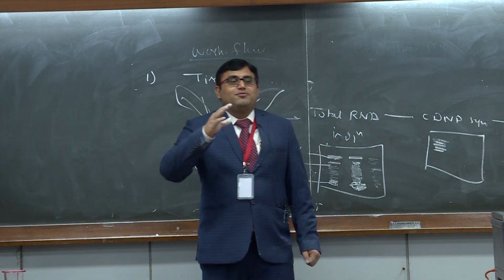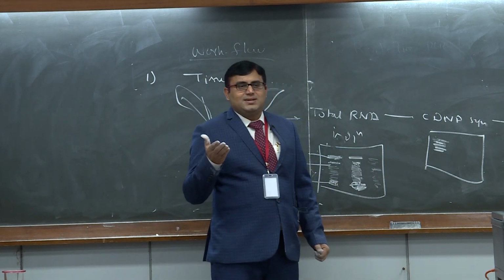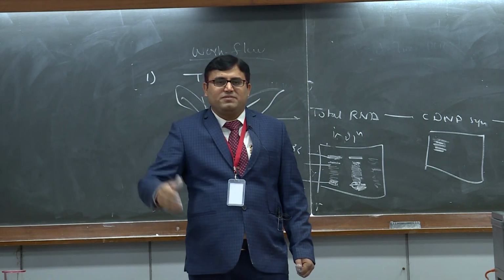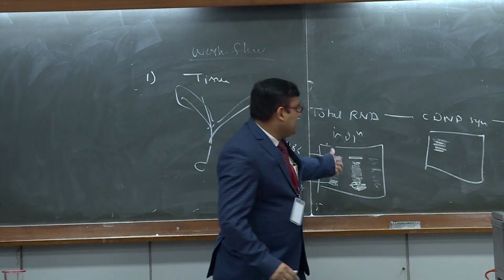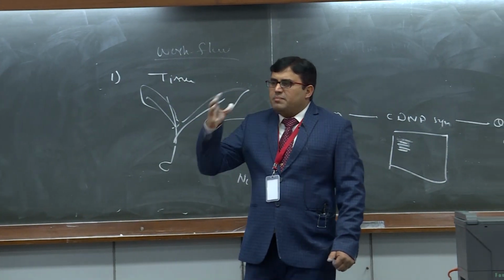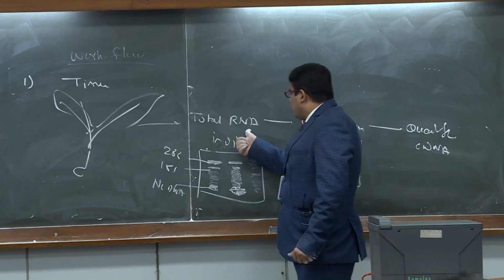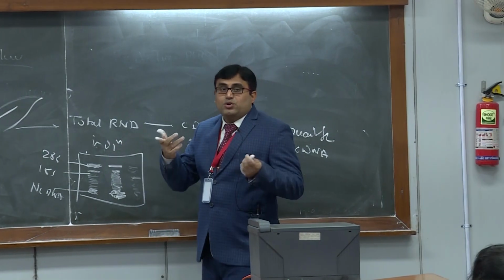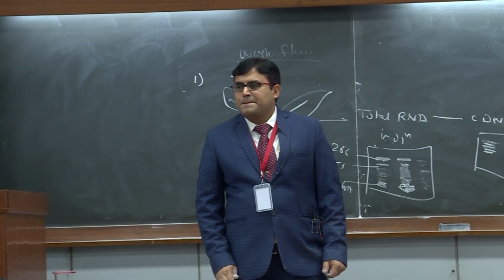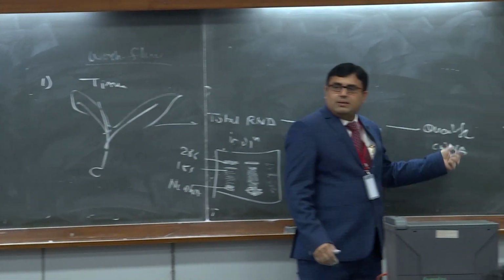Exactly. Because if you take more or less concentration of this, it means you are biased. If you take more concentration of RNA, definitely the number of transcripts and expression will vary. So at this level, or this level, you have to check, you have to unify. The recommended method is to quantify at the cDNA level, because if you quantify at the RNA level, we don't know what will be the efficiency of conversion of RNA into cDNA, right? So the best is to quantify at this level.